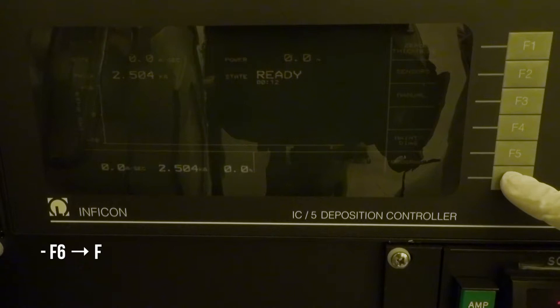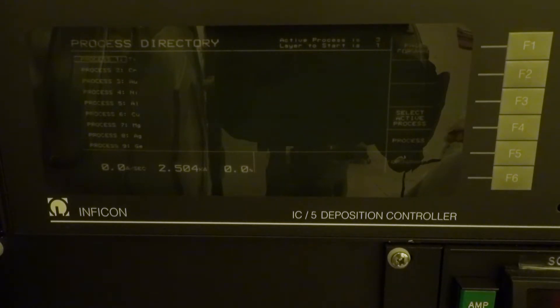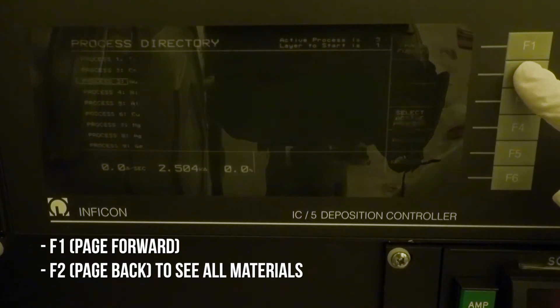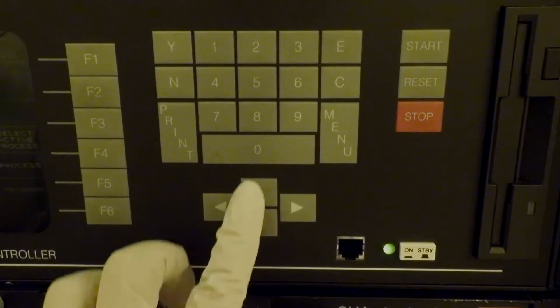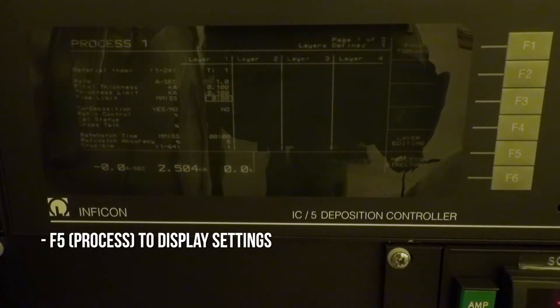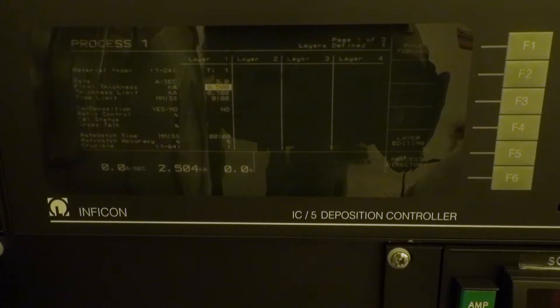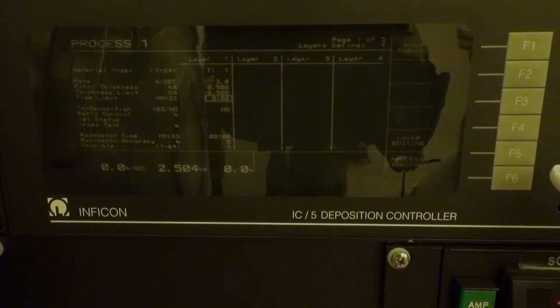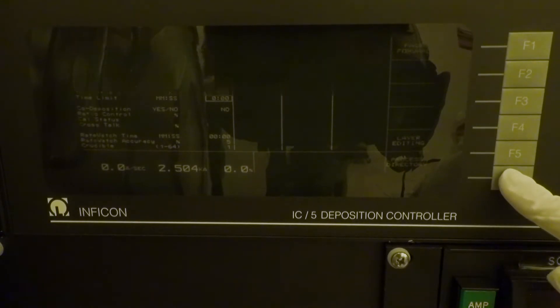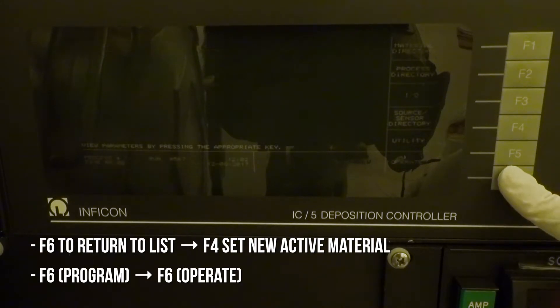To begin programming the deposition controller, press F6 on the keypad, then press F2 for process directory. The controller will display a list of materials; press F1 to page forward or F2 to page back. You will need to set up each material you are going to use. Use the arrow keys to highlight the material you want, then press F5 to display its settings. You should only change the deposition rate, final thickness, and thickness limit. Ensure that final thickness and thickness limit are set to the same value. After setting up the material, press F6 for process directory to return to the list. Highlight the first material you are depositing and press F4 for select active, then press F6 for program and F6 again for operate when ready to run.